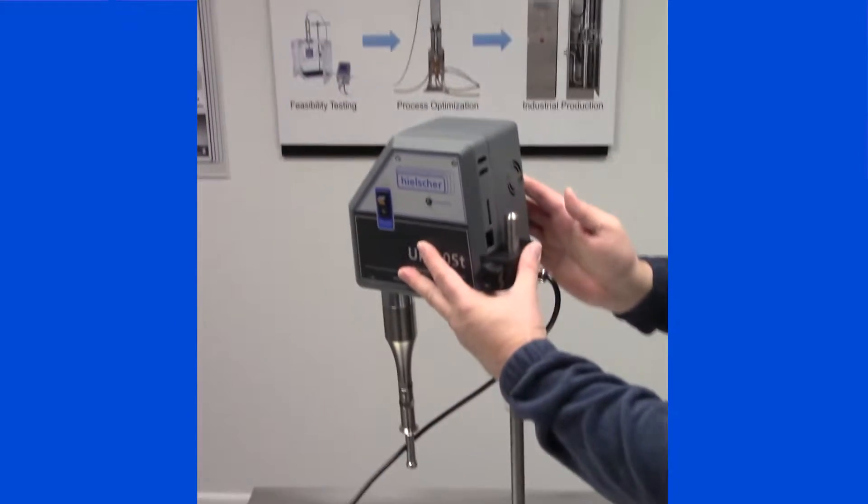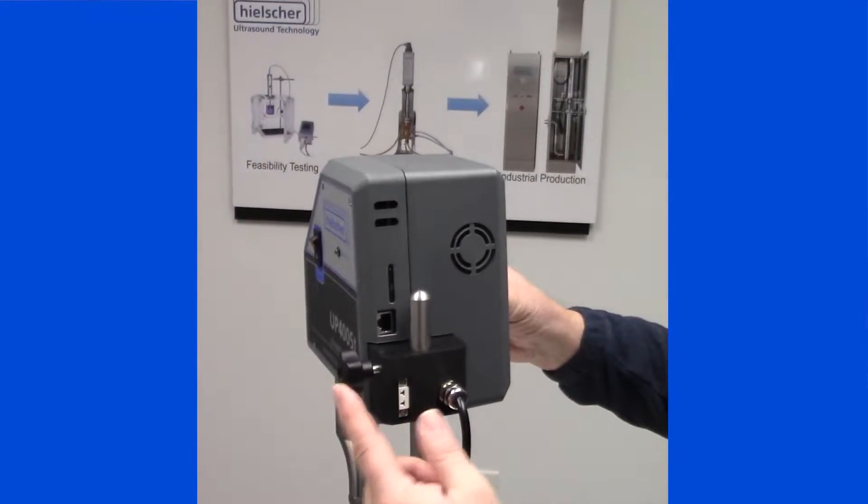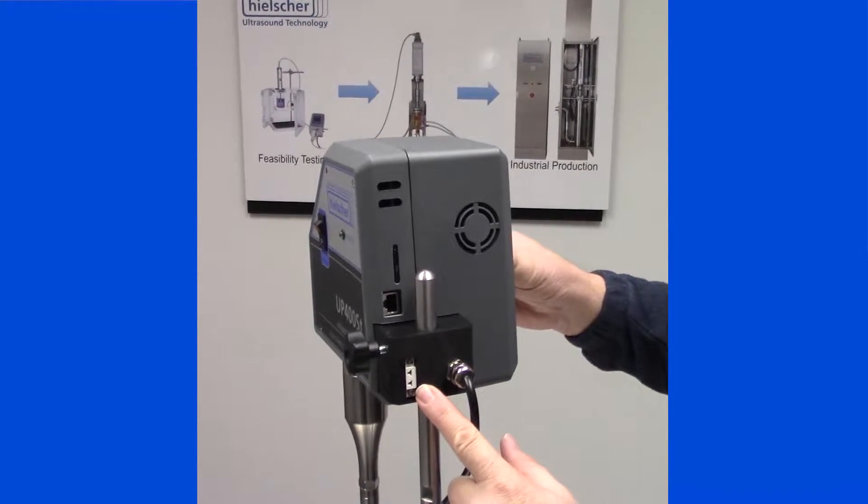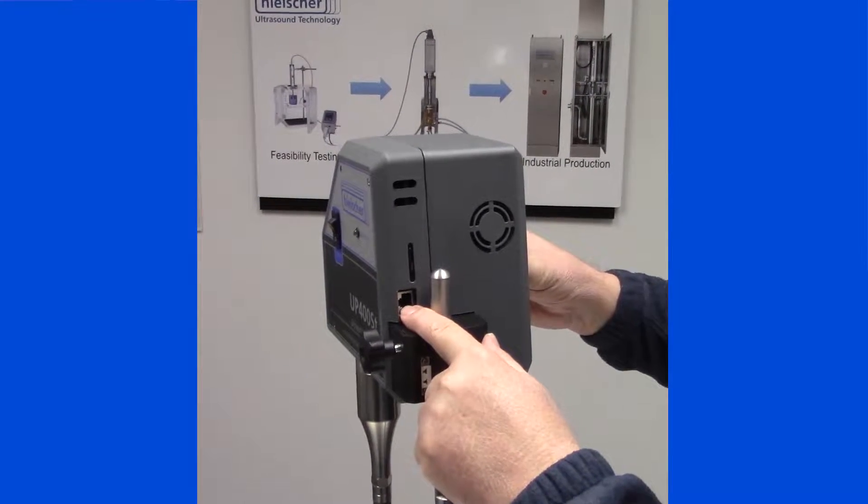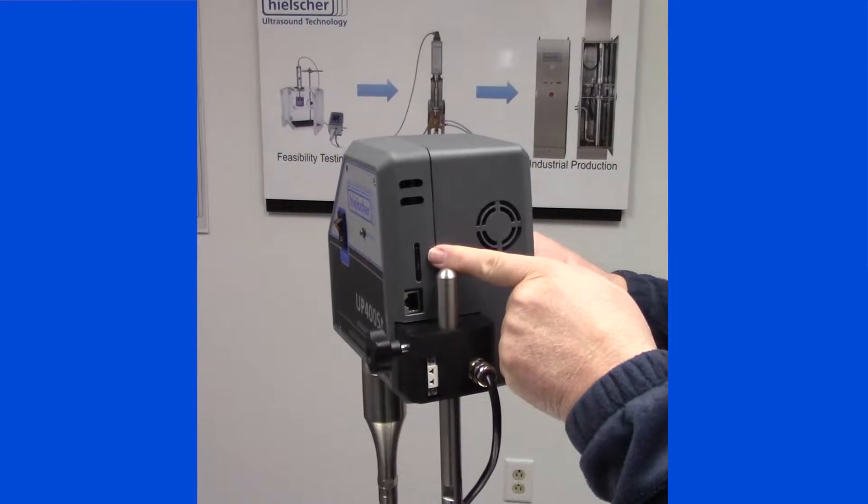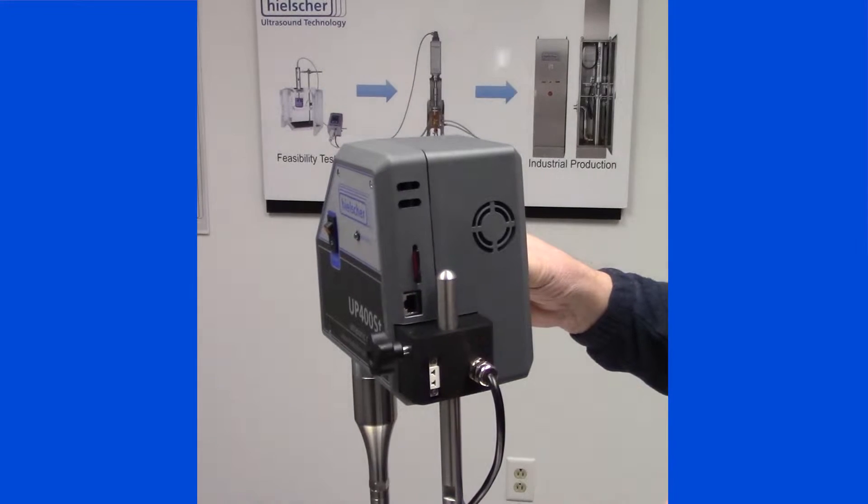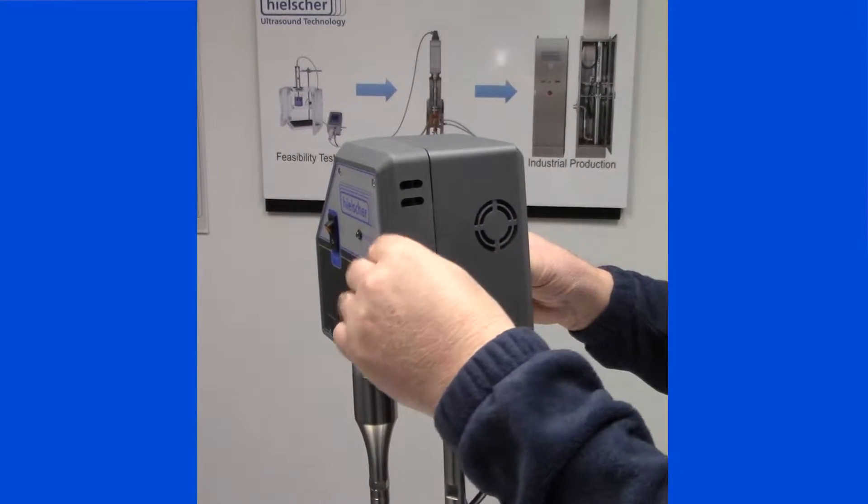Let's take a look at the back of the unit. We have the handle, first and foremost, to adjust the height of the unit. Temperature probe inlet, Ethernet port, SD card for where it records all your data. Let's just pop that in and out really quick. That's how easy it is to get your data card out.